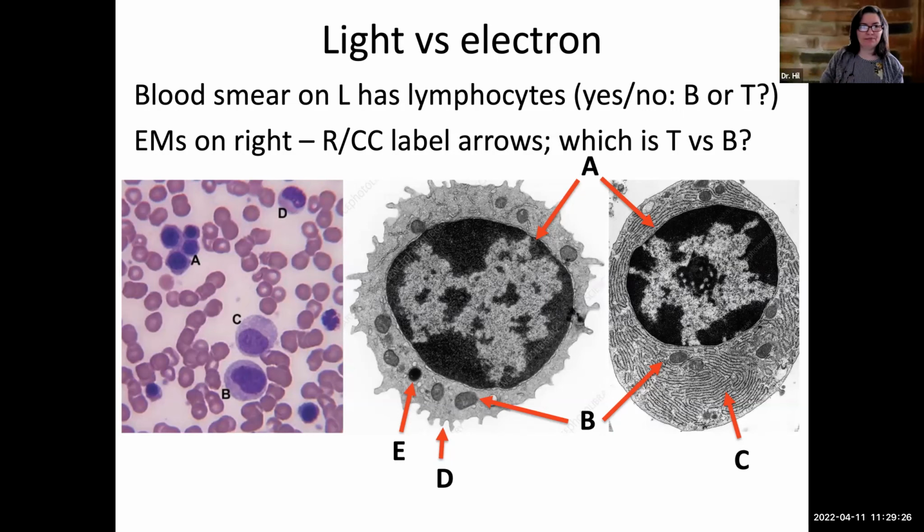That's right, Courtney. That's right, Haley. Courtney's right. Haley, what you've described is an excellent description of what T cells do. Courtney said make antibodies. Haley said cellular immunity. Yeah, it's easy to get them mixed up, right? Those are the two different jobs. T's provide cellular immunity. We'll talk more about what that really means at the end of the quarter. And B's make antibodies. We'll talk more about those details at the end of the quarter also. But right now we can just admire how beautiful and different they are.